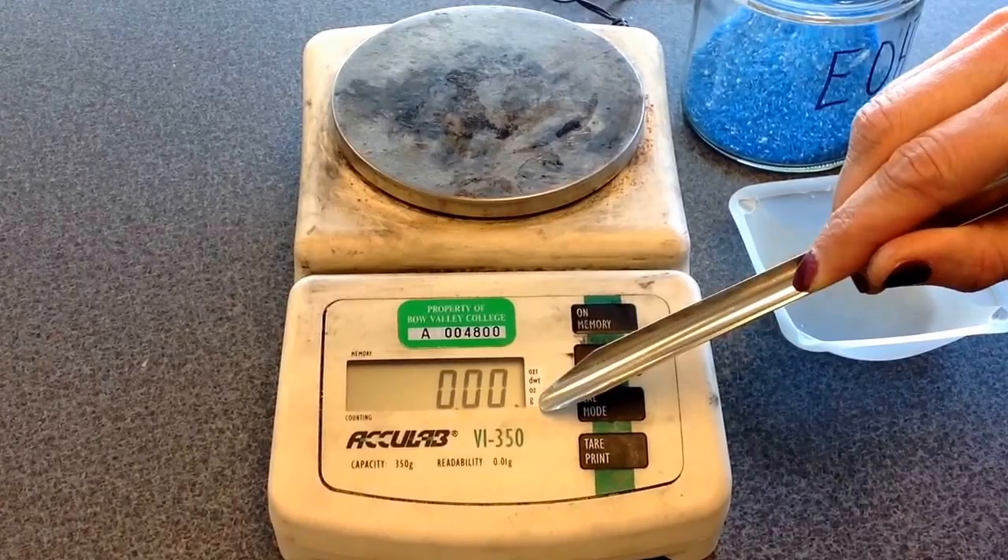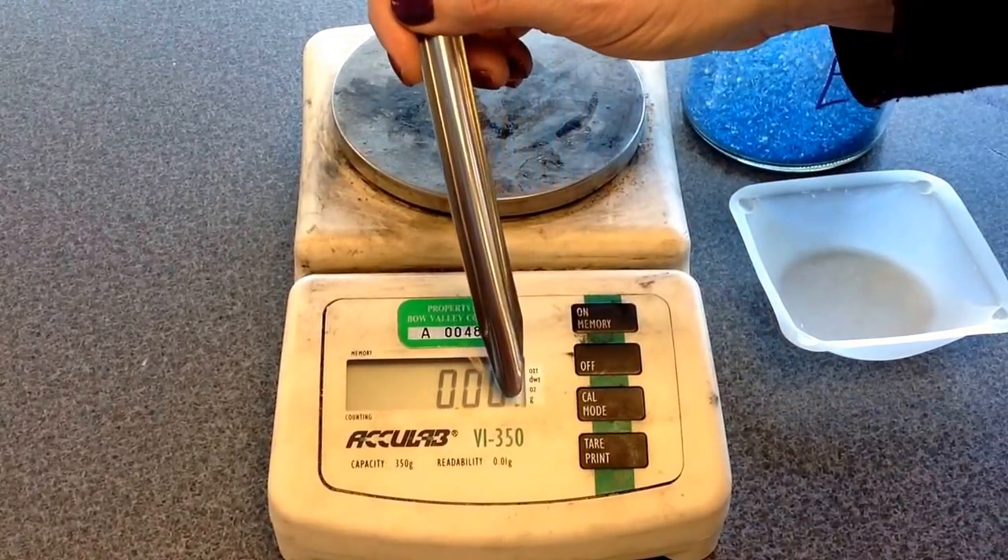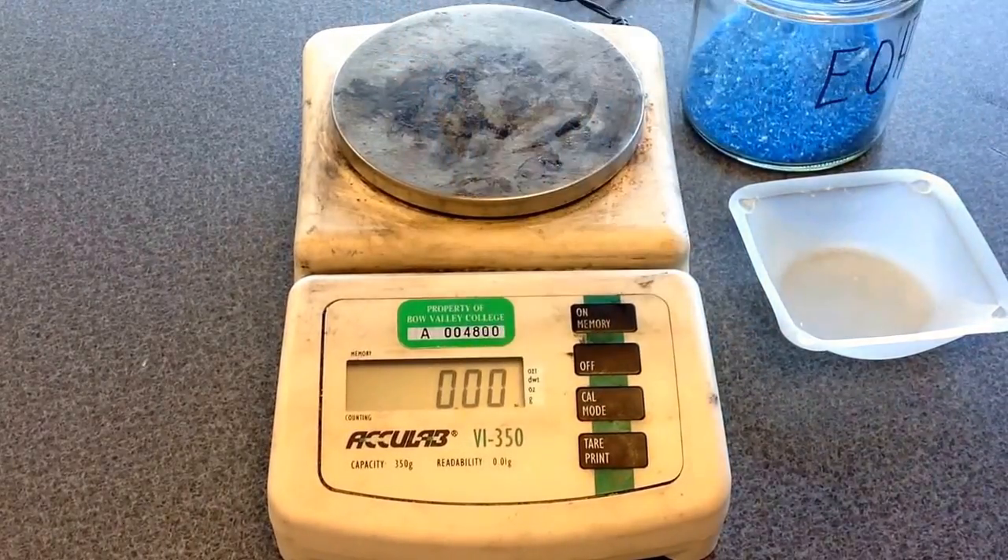You do want to make sure at this point that the grams are set — you'll see a little arrow right here pointing to grams, so we want it to be in grams.